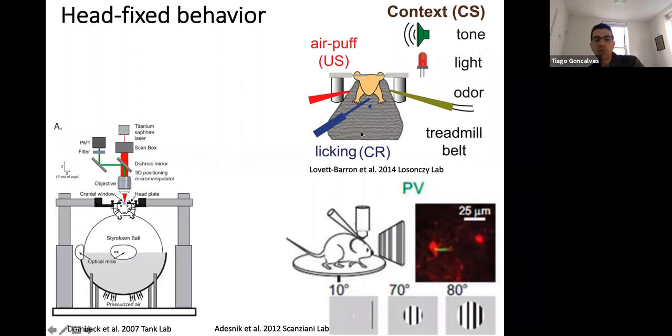And there's very different approaches. The very famous mouse and styrofoam ball. There's the treadmill approach. There's amazing stuff where mice actually voluntarily come up to the microscope. They walk up and they attach themselves to the microscope for a reward. And the lab of Mark Harnett at MIT just came out with this amazing navigation system where the mice are navigating in a little plate that is suspended, and it's almost like freely moving. They feel like it's freely moving, but they're actually in the same place. It's like this room that they're in that moves.